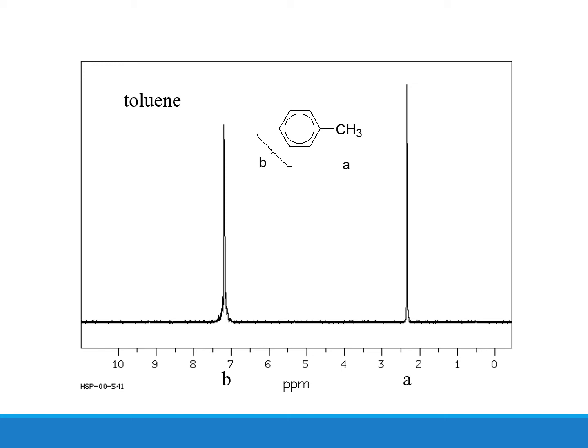Clearly you can see that the methyl hydrogens are 3 bonds far from the ring double bond, whereas the ring hydrogens are 2 bonds far from the ring double bond. That tells you the effect of the delocalized electrons on each of these hydrogens. That's why you can see 2 peaks for the toluene molecule.